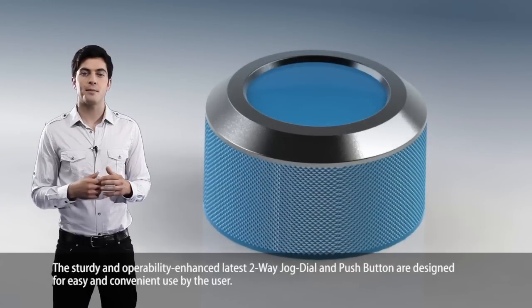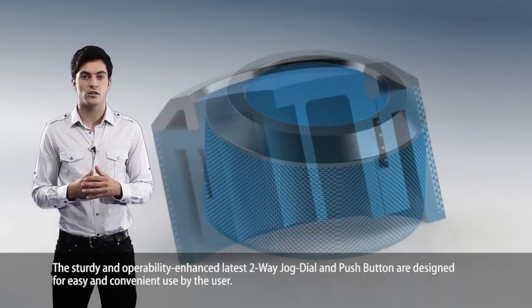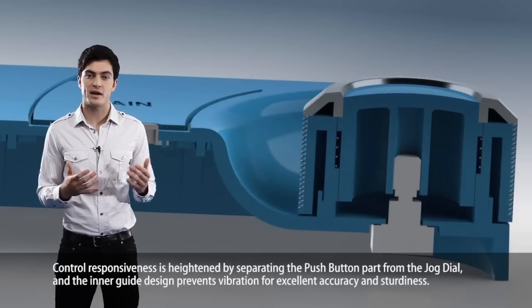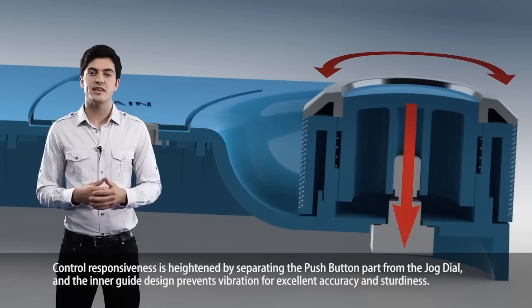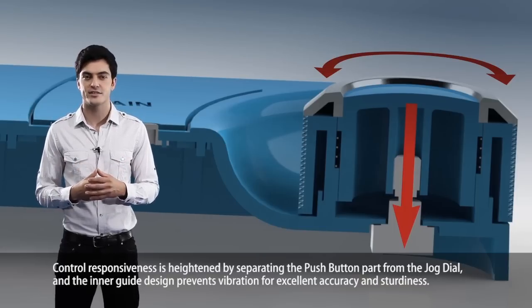The sturdy and operability-enhanced latest two-way jog dial and push button are designed for easy and convenient use by the user. Control responsiveness is heightened by separating the push button part from the jog dial, and the inner guide design prevents vibration for excellent accuracy and sturdiness.